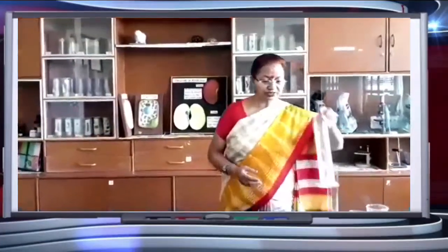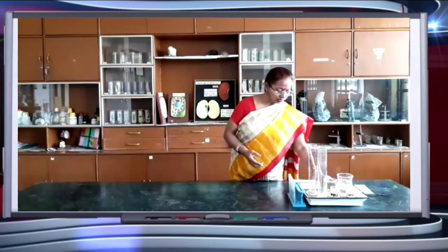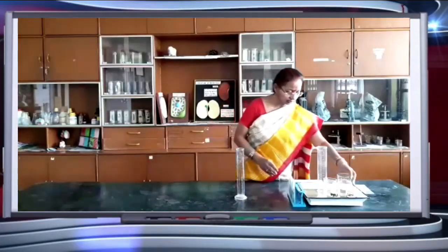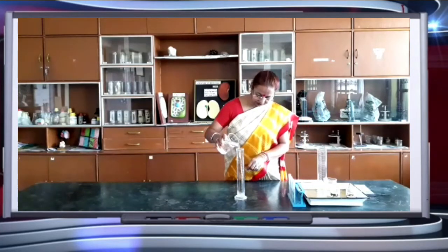We have two measuring cylinders in which we are going to test, and pH paper. First of all, we will add water in the measuring cylinder for two different samples.